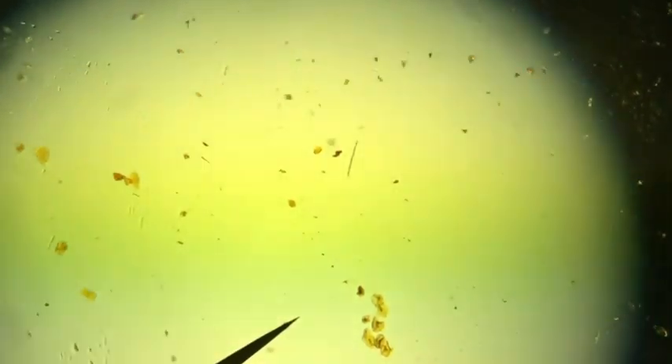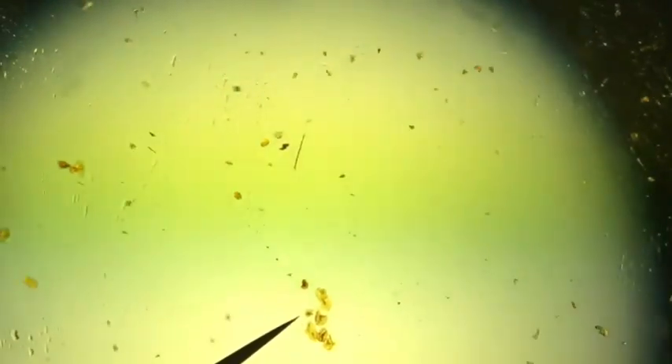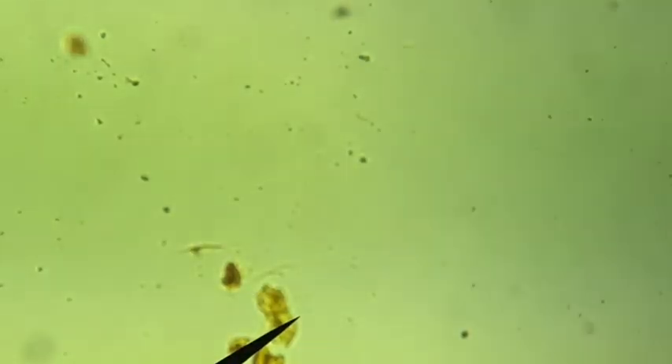Here I've got the cheek cells, which would be the animal cells, under the microscope. There's a cluster of maybe six or seven of them. You can look around your field of view and find some — some might have been broken open, others might be intact. I'm going to use my pointer to put one in the center, then switch to medium power.